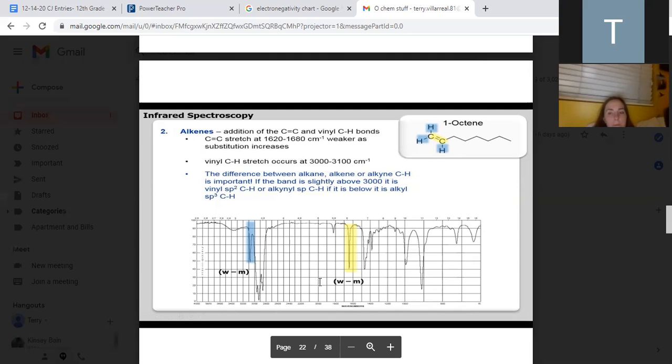I turn my light on and my million photons go across this space. Now, say all 1 million get there. I will say that I had 100% transmittance, meaning that I transmitted all the photons from where I started to where I ended.